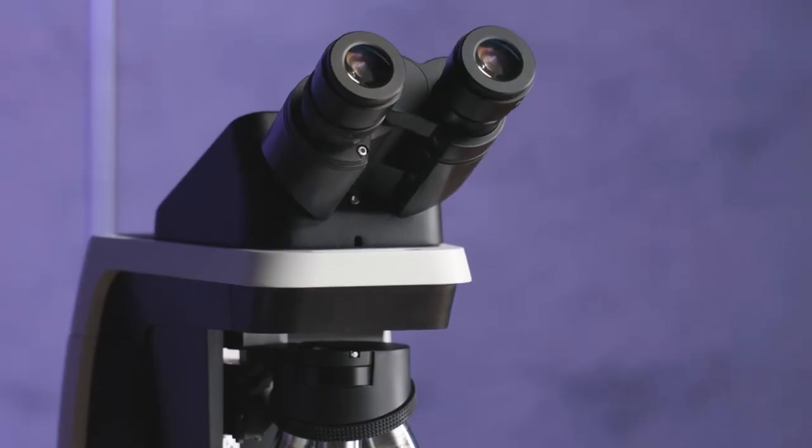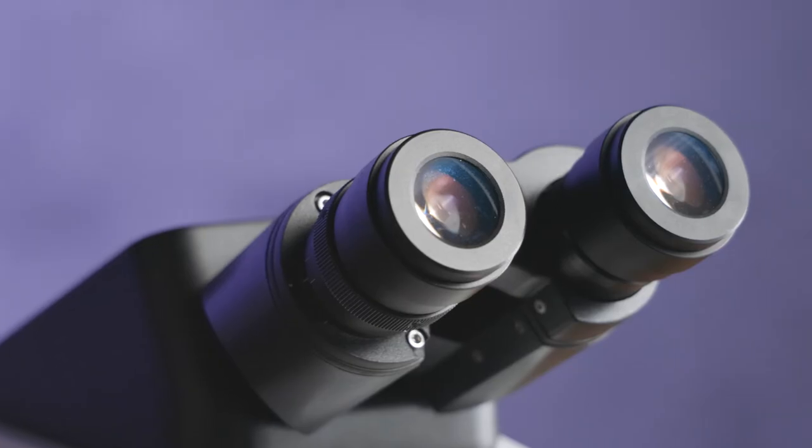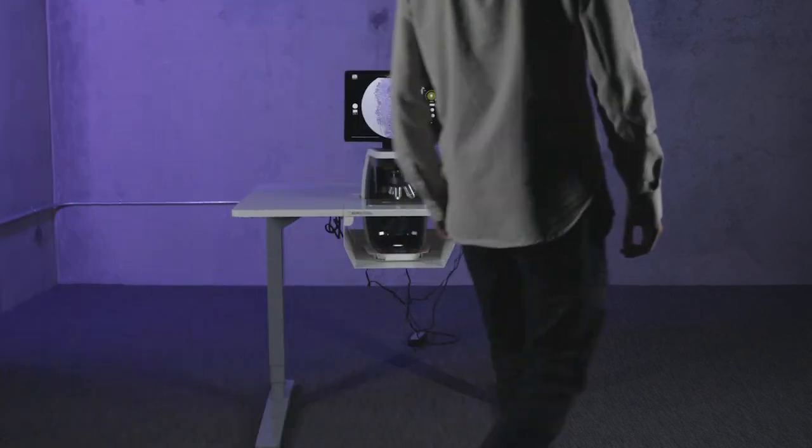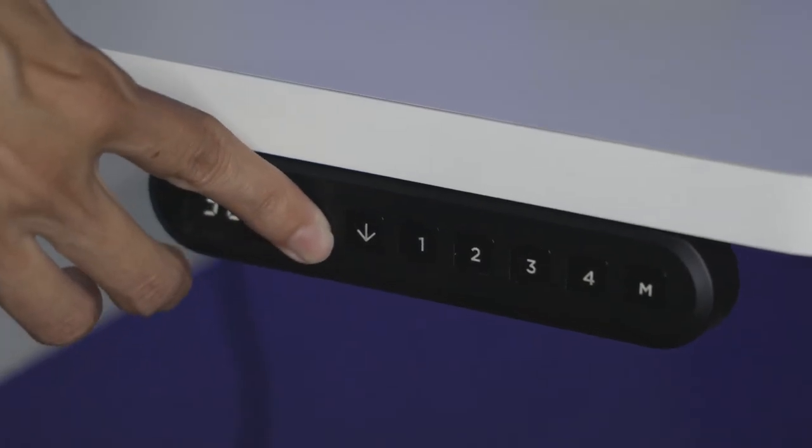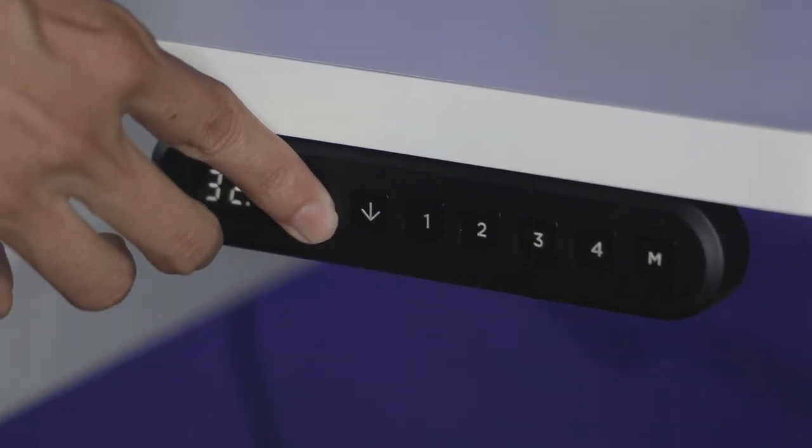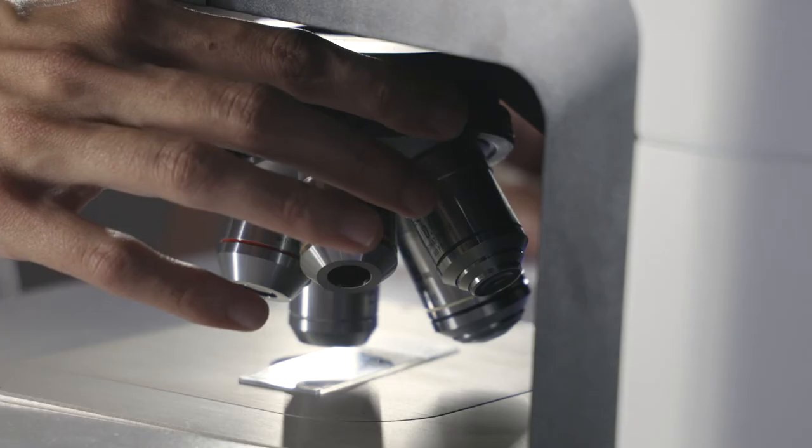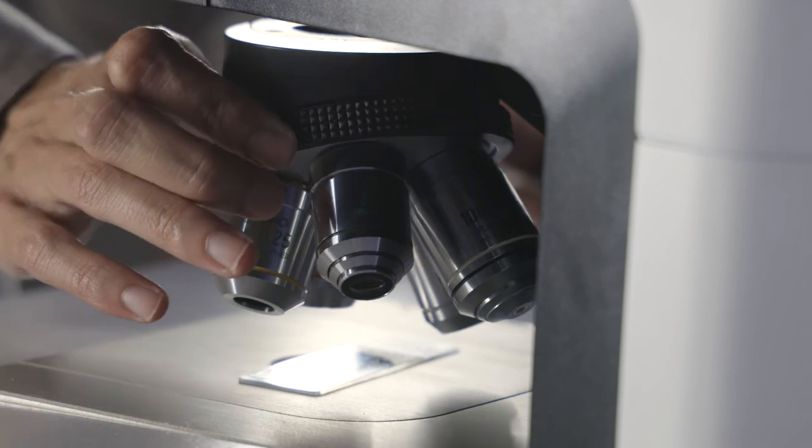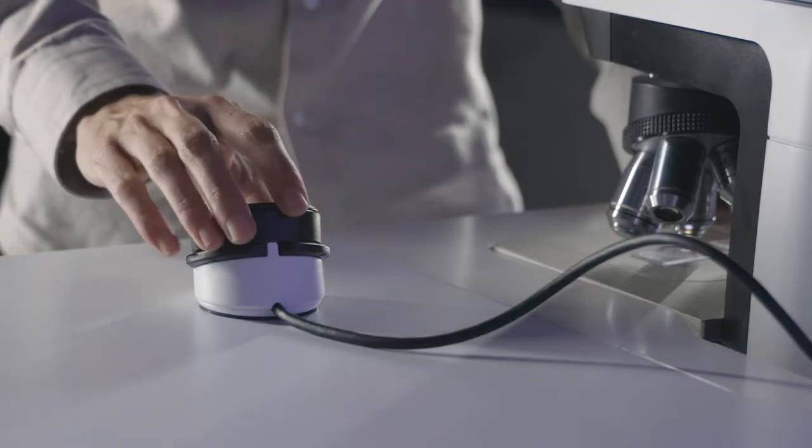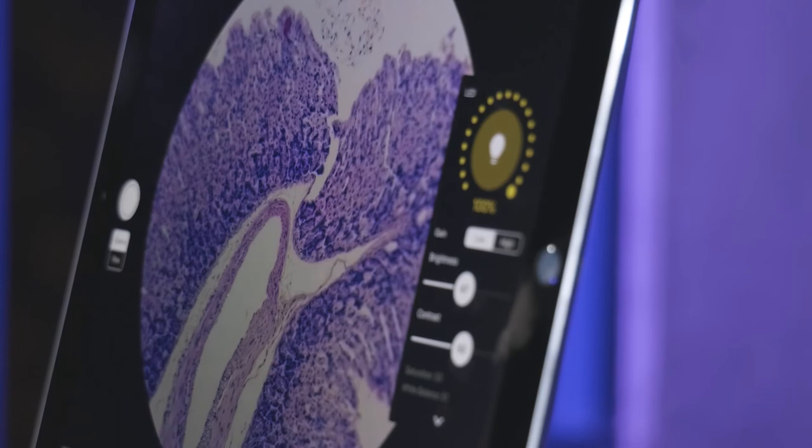We also collaborated with LabConco, the world's leading manufacturer of safety cabinets and lab furniture, to develop the TrueErgoTable and REBEL Logic Plus biosafety cabinet. Both systems bring the microscope stage flush with a working tabletop surface to drastically improve your comfort and workflow.